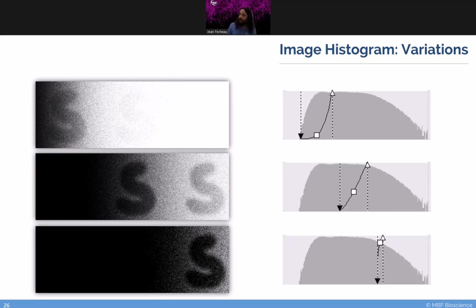But the other thing that I want to make clear here is that, as you can see, I'm able to get better contrast as I work with the brightest parts of the image near the bottom. Near the top, I'm looking at a very dim signal. And so even though I can increase the contrast and start to see what's going on with the dimmest parts of the image, ultimately, the better that you can do to get a brighter signal to really fill out that histogram window at the time of acquisition, the more data there is for us to work with the histogram later.